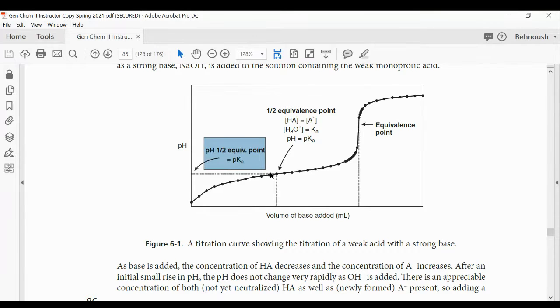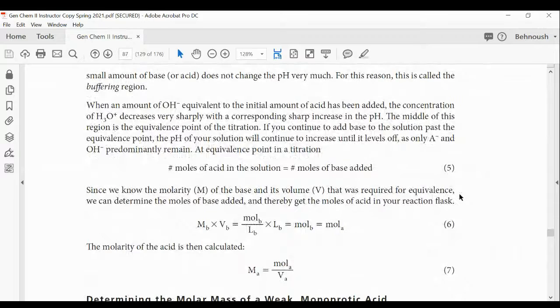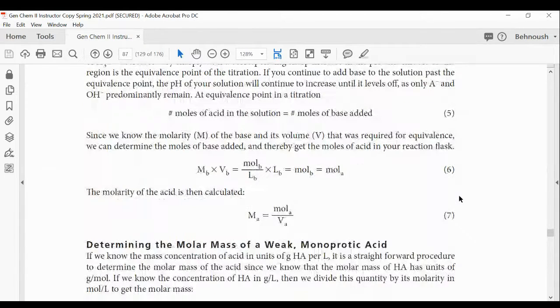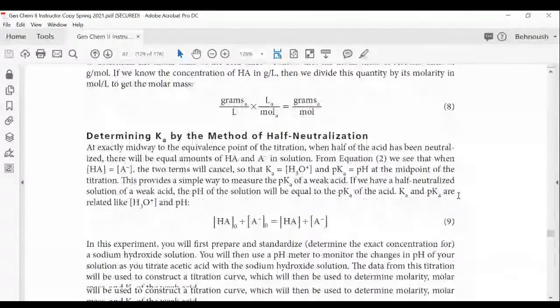Because in order to find the concentration for sodium hydroxide, you don't use the vinegar, you would use KHP. And with the KHP, which is a primary standard, you can find the value for concentration.